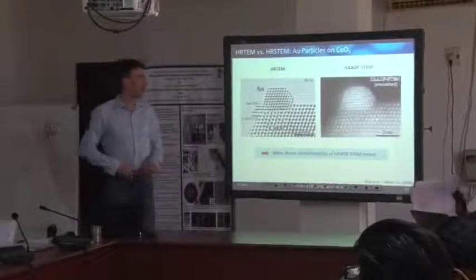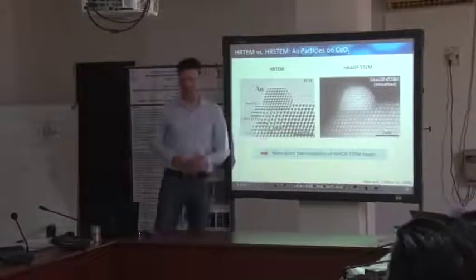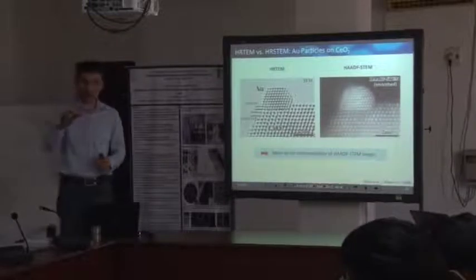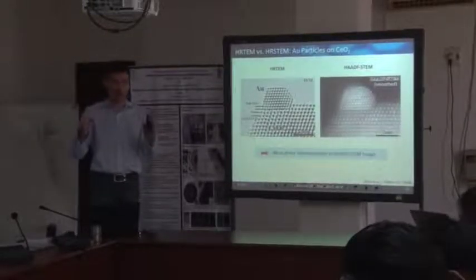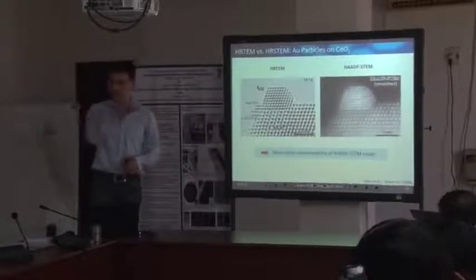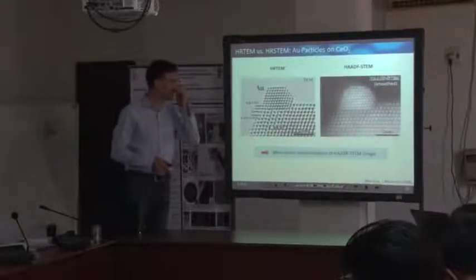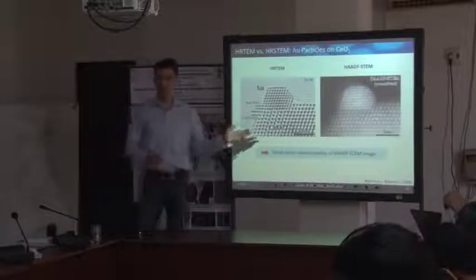And today I'm going to present the scanning technique, which means that we have a very fine electron probe instead of a parallel beam. We just raster scan that across our sample. So here's already a very beautiful example of how those images might look.